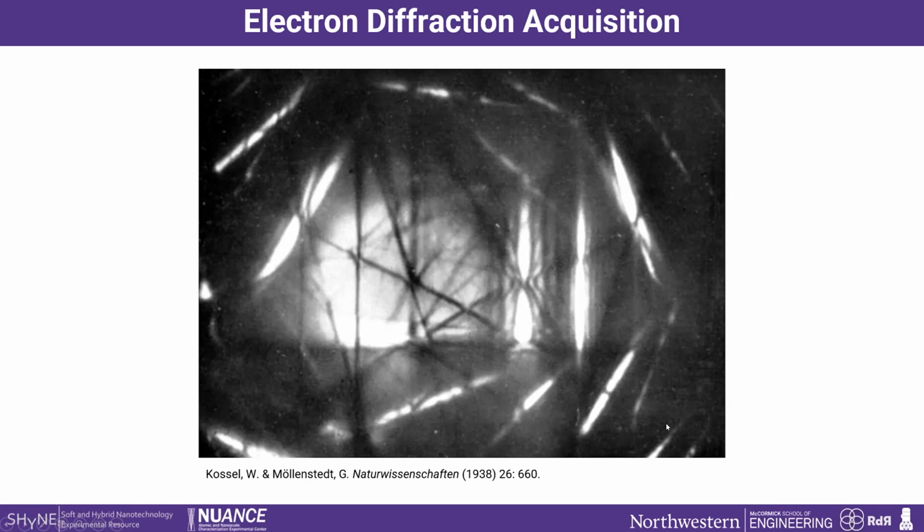So you have a lot of the Kikuchi lines that we saw this morning. You have dynamical diffraction, you have the positions of the diffraction spots, etc. That is very complex. So it's a very complex experimental result, one that you would want to go back and analyze point by point.